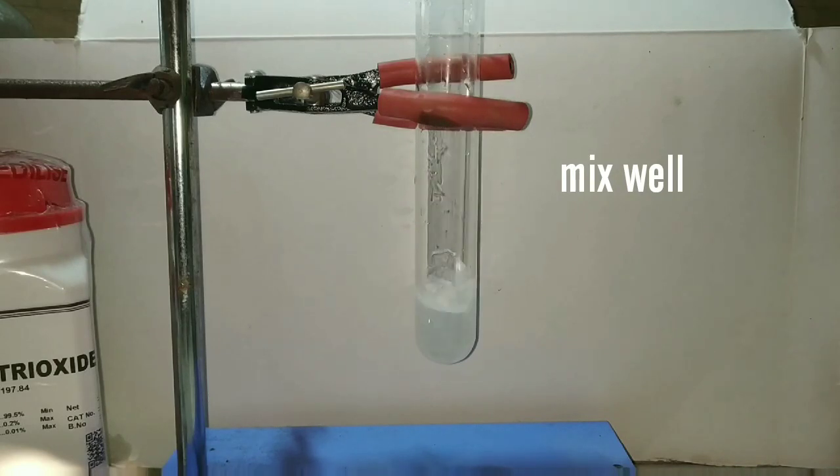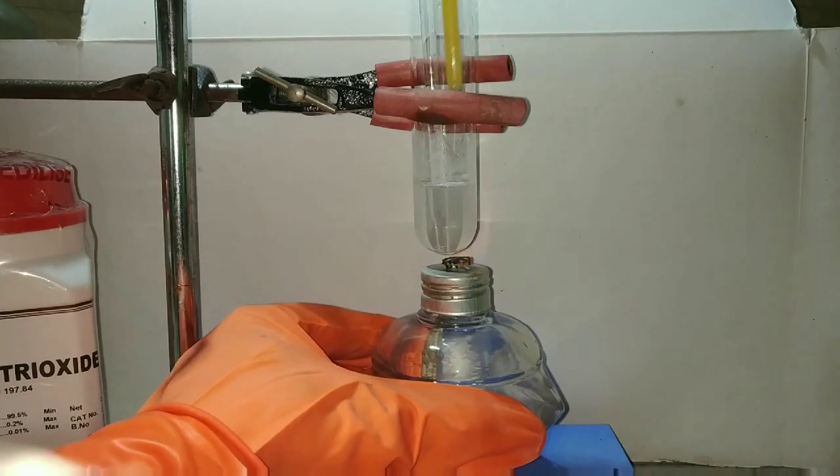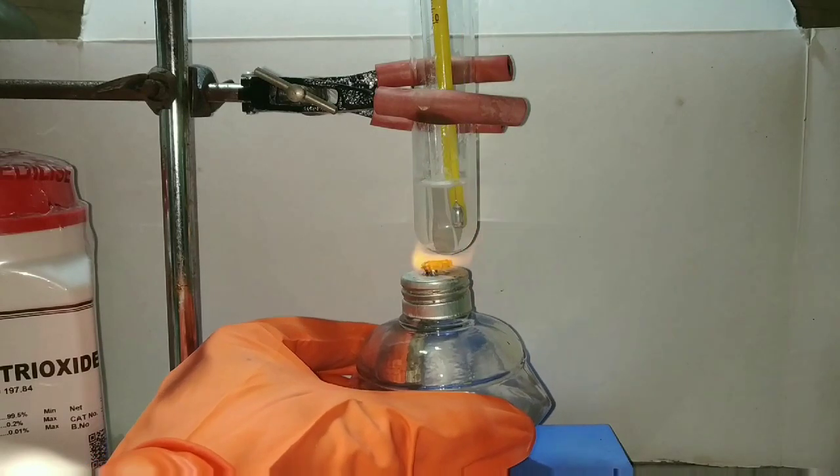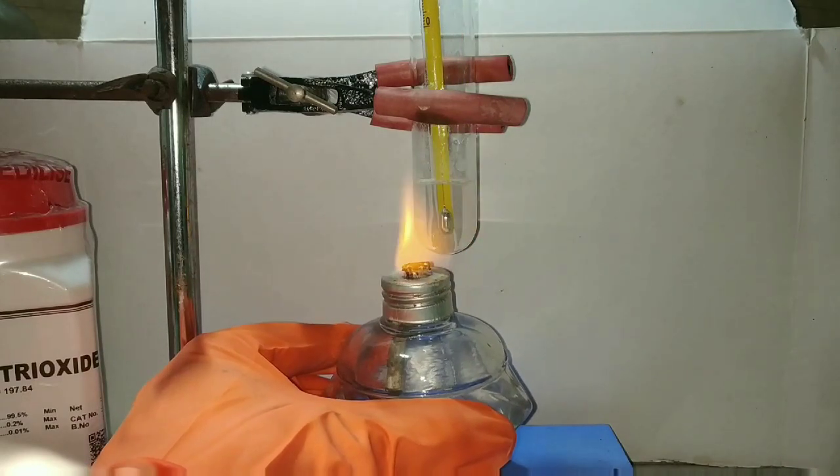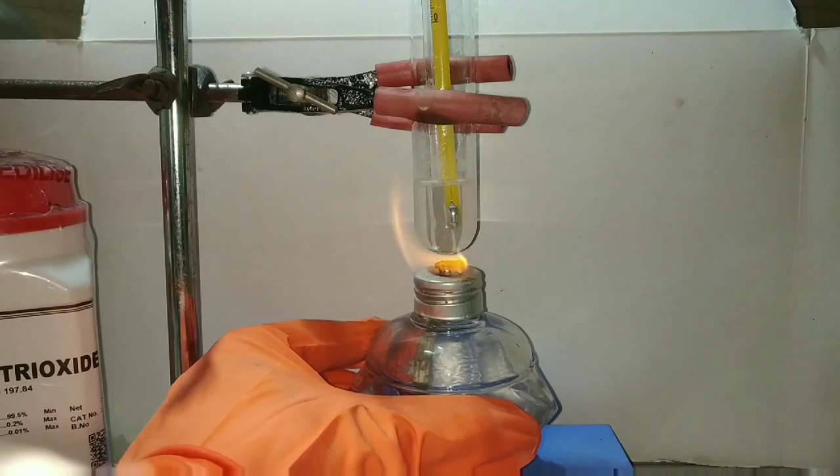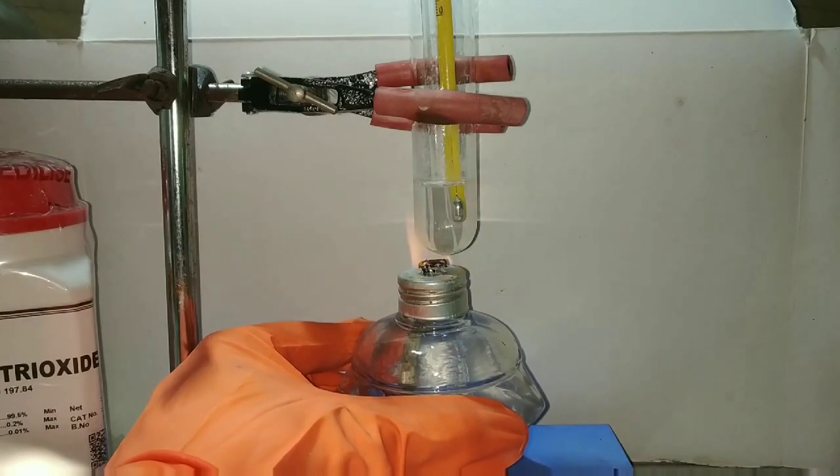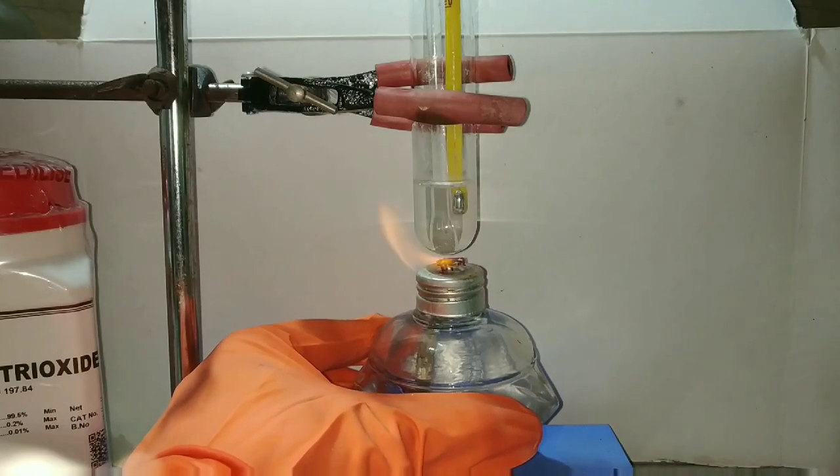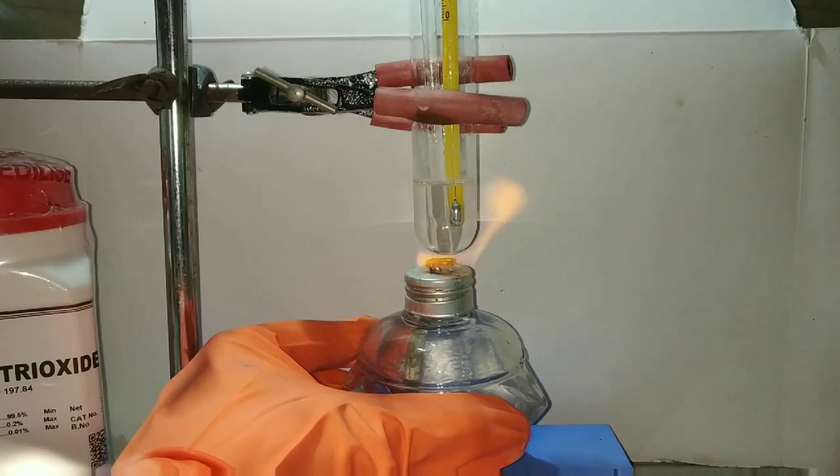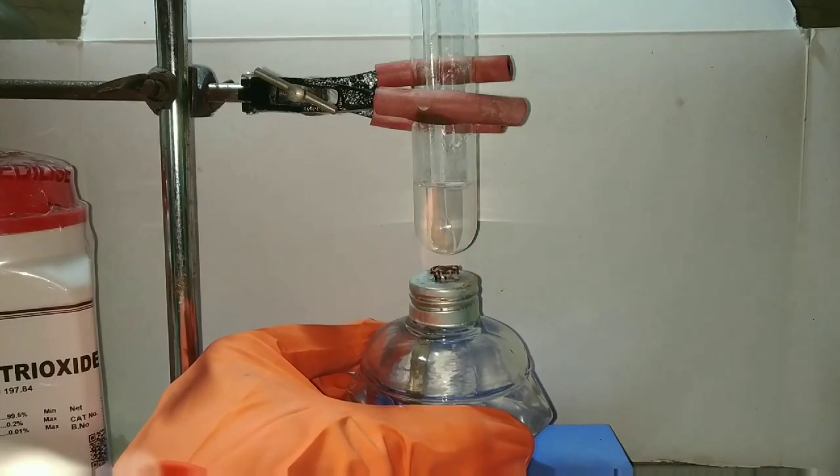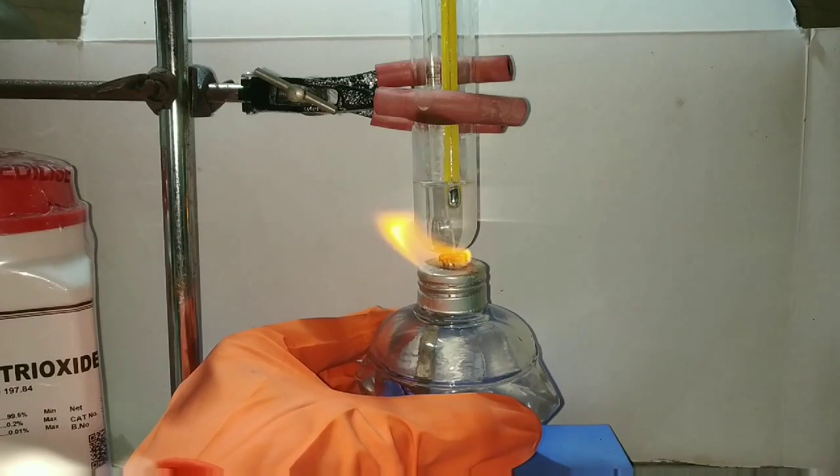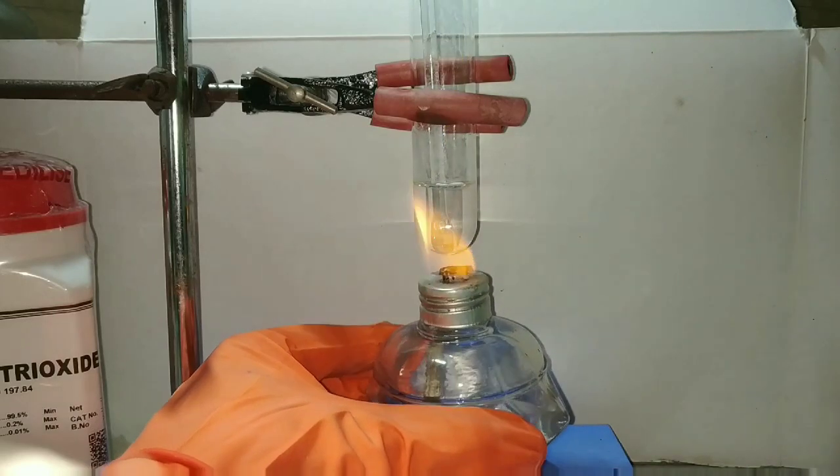Now we will mix the contents thoroughly. The temperature required for this reaction to take place is around 90 degrees, so we will be heating the contents and recording the temperature. You can observe that the contents are turning clear, which means that the arsenic trioxide has completely reacted with the sodium carbonate and the temperature now reads around 90 degrees. So we will stop the heating process.